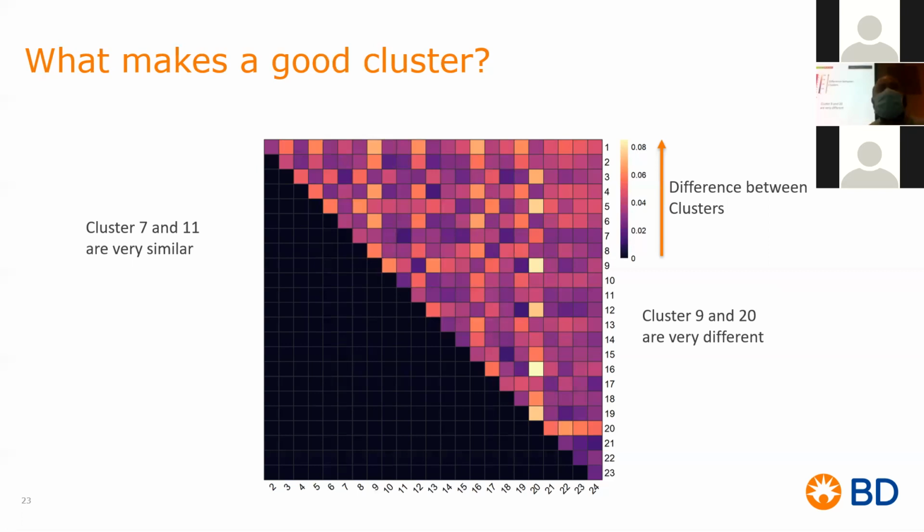The same goes for doing only flow. If you only do flow, you don't know what's happening at the gene level. We know of different viruses or different conditions that will silence a gene, but if the protein is stable, whatever was already on there is already on there. And like anything, every experiment we do is a snapshot. So if you didn't catch it at the right time, you may have protein, but you're not seeing what the virus or what your condition might be doing at the gene level. If you want a complete story, do multiomics.